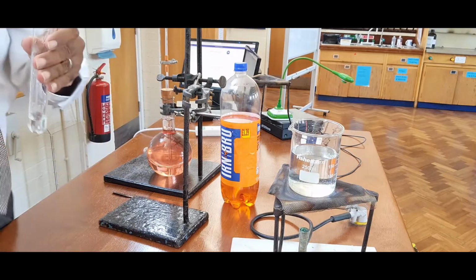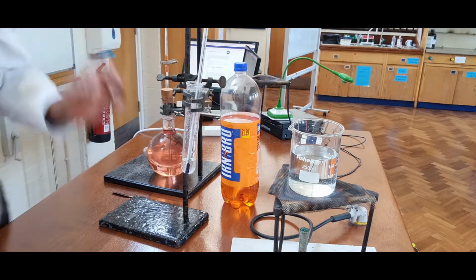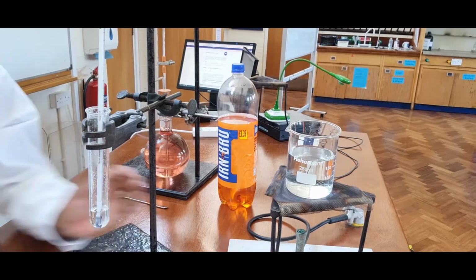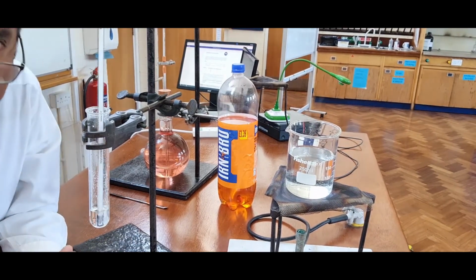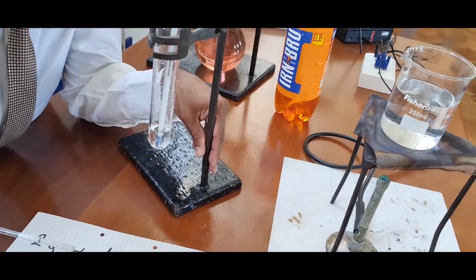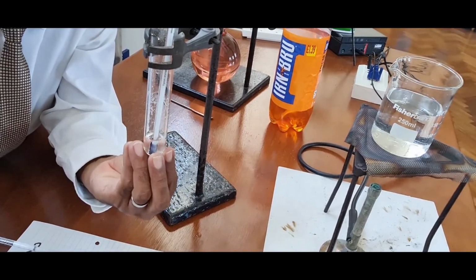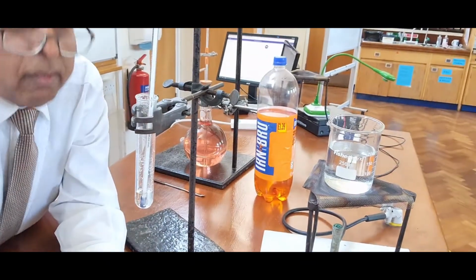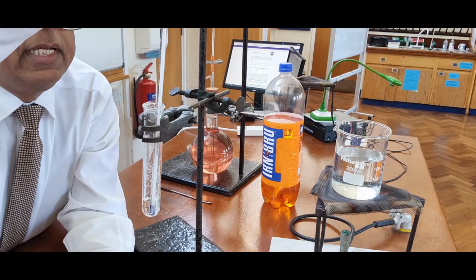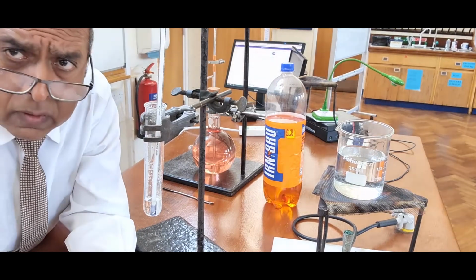Now what we do is we put a thermometer in, and now we look to see when that mixture forms crystals. And we look at the temperature. At the moment, the temperature is 53 degrees.